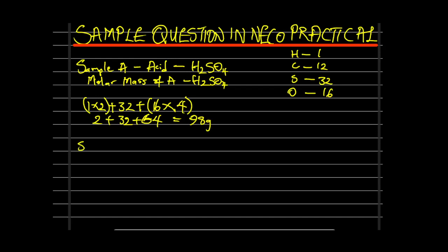And then for our sample B, which is our base, sodium trioxocarbonate, the molar mass will look like this.